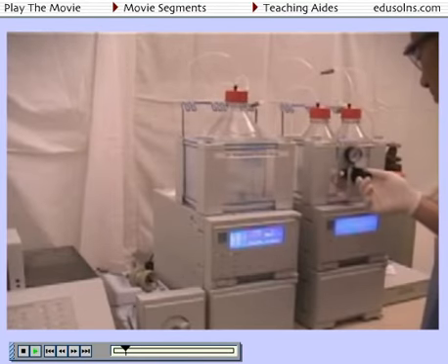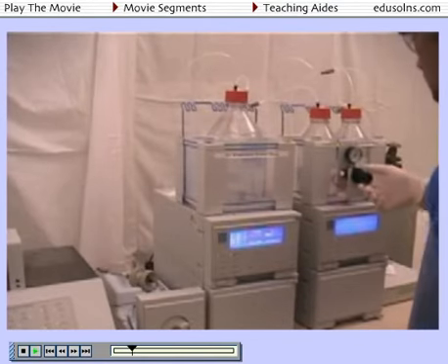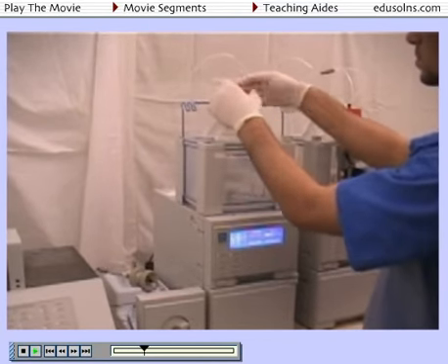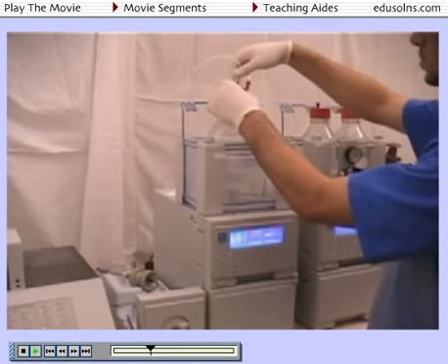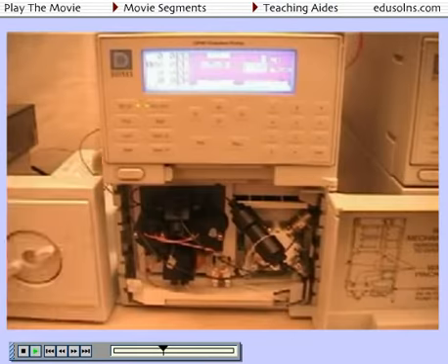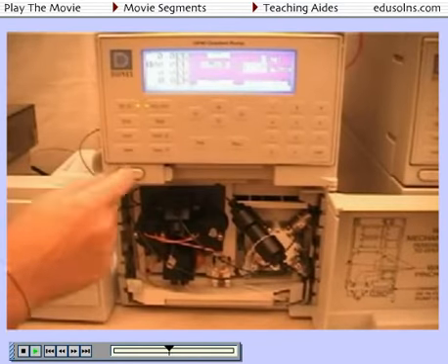To shut down the system, exit the software controlling the HPLC. Turn off the detector. This will conserve the life of the lamps. Next, turn off the pump, and if necessary, adjust the pump from computer control to manual control. Switch the solvent source to the washing solvent. This is usually methanol, but may also be deionized water.